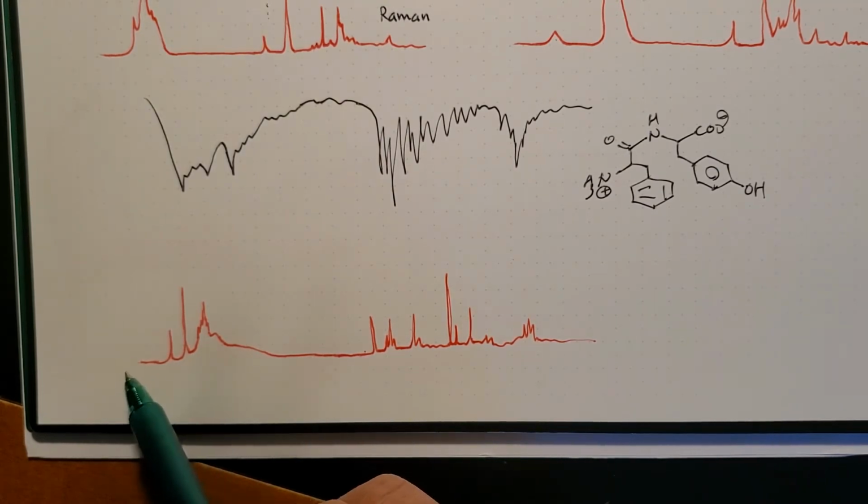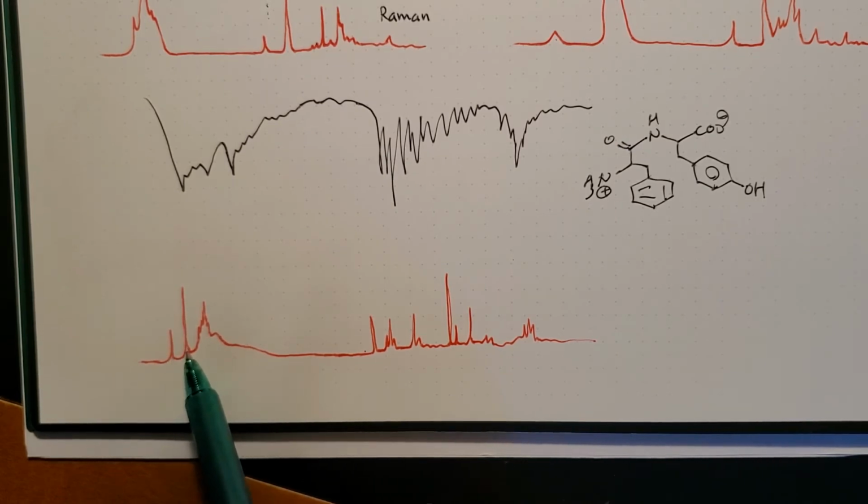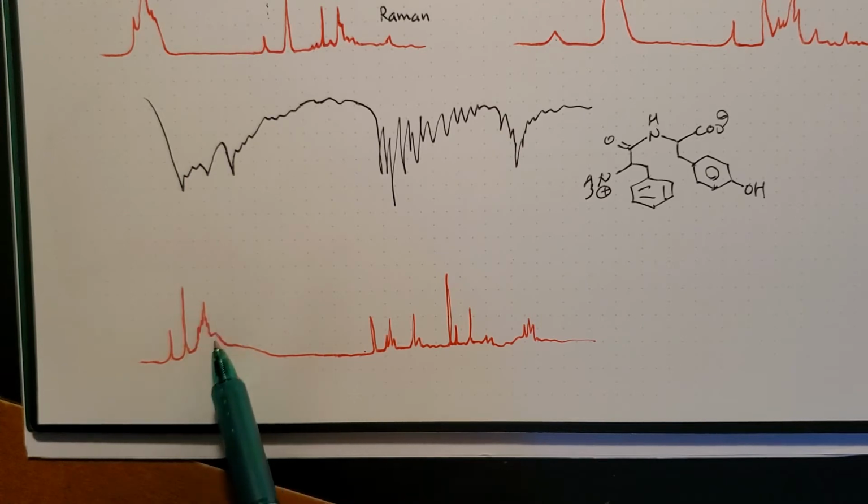But because the Raman is not really broadened by interaction or polarity, as you can see, you see the OHs of the two different hydroxyl groups from the alcohol and carboxylic acid. You can see the difference, and if something happens to one of the OHs and a shift happens during the bioprocess, you can obviously notice. And then you also can notice what's happening to the sp2 CHs and sp3 CHs.